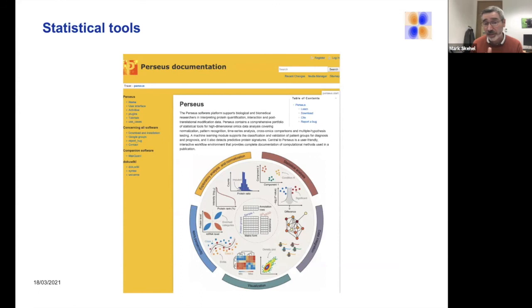So essentially Jürgen's raison d'être is to initially take away the mass spectrometrist's job by making search engines available to everybody, and now he's killing the bioinformatician by giving everybody this informatics and statistics tool. I can say that because he said it with his tongue in cheek. But Perseus, again, is free to download. You need a PC. It won't run on a Mac. Okay, so you need to have a Windows-based PC to run this.